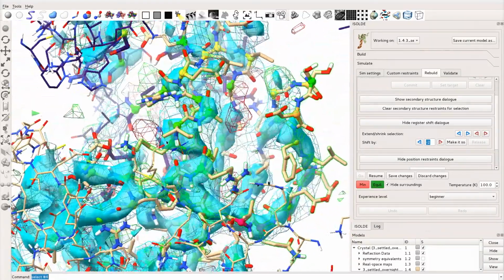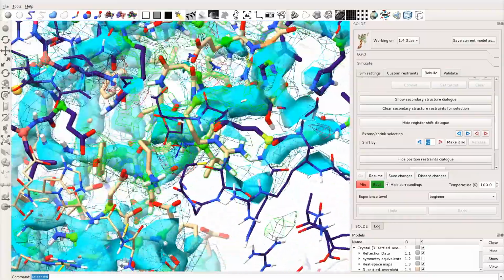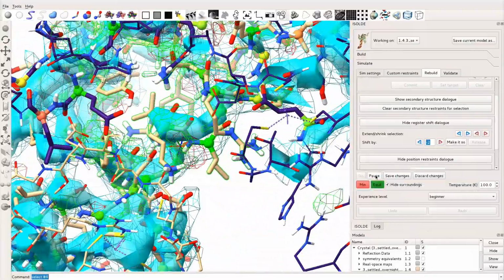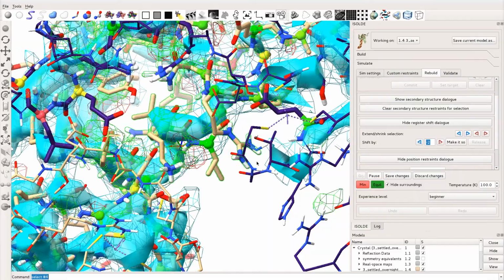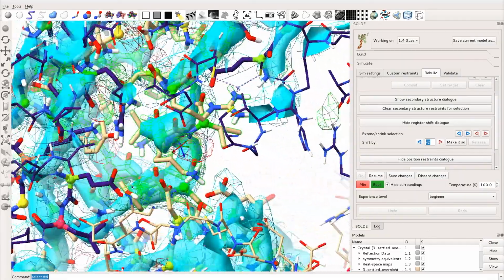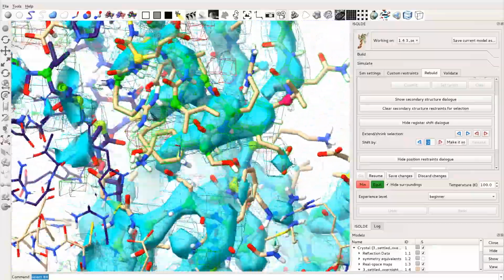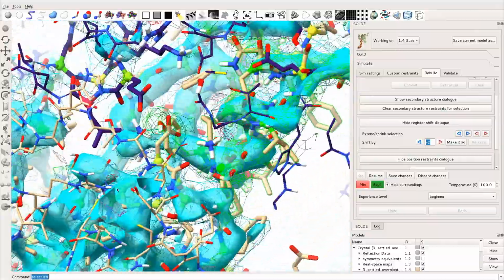We can see the tyrosine residue here is settled happily into the large positive density blob previously occupied by serine, but a few other bulky side chains are in need of a bit of remodelling. For the most straightforward tasks, you can simply drag them with the mouse, but in most cases it's easiest to use temporary position restraints on key atoms to precisely set the target location.